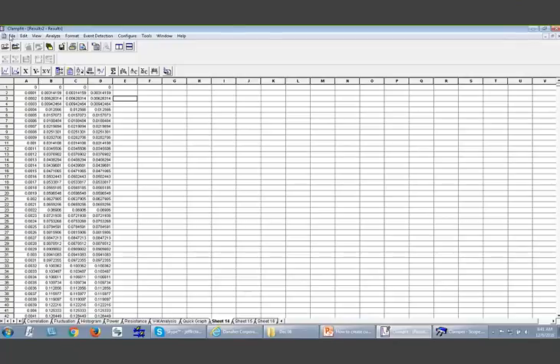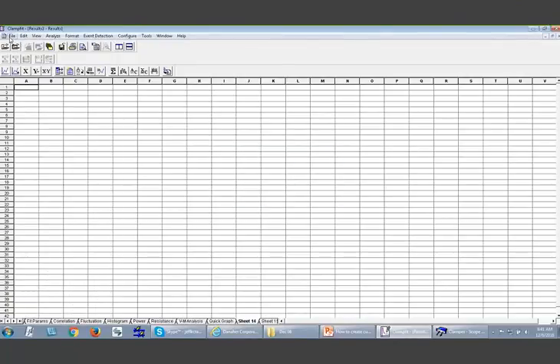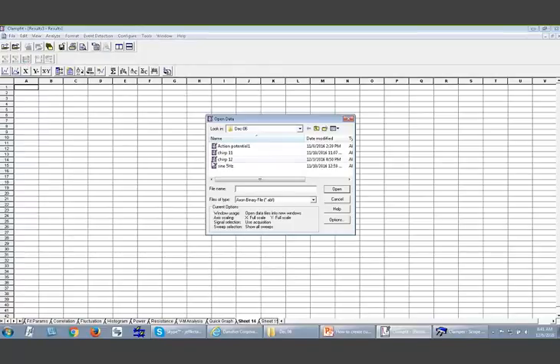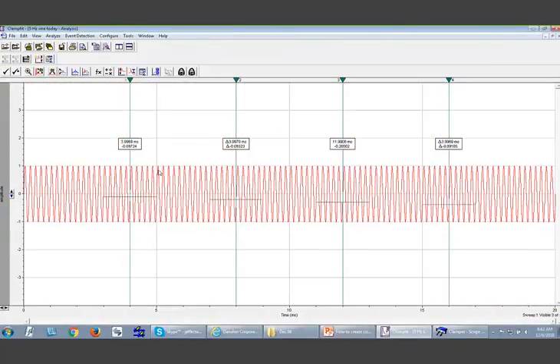Let me close off. Now you can open the data in ATF format, because it's created in the results sheet. Go to the ATF format, select 5 hertz sine today, and open it. Now you can see a very beautiful 5 hertz sine wave. Amazing.